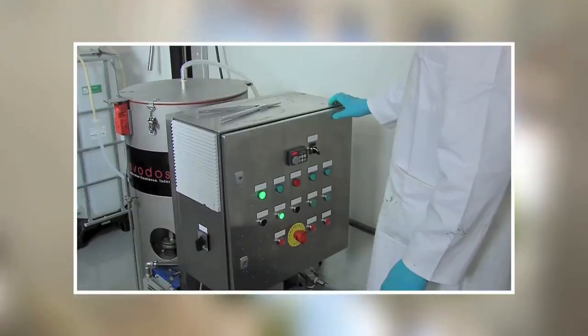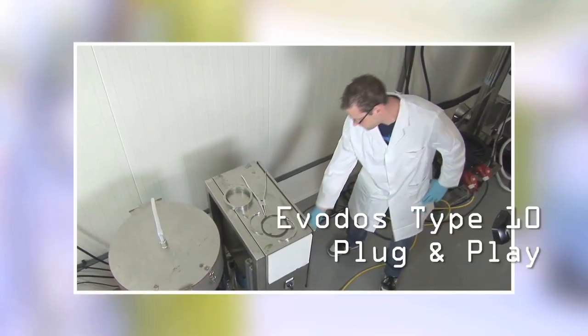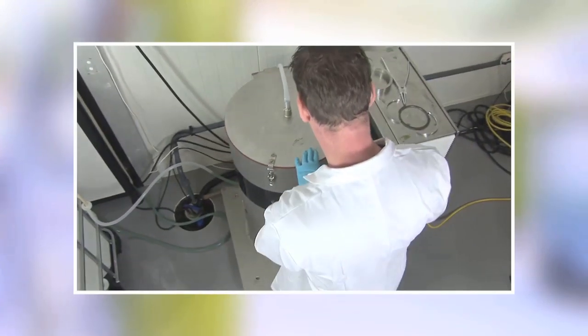The Type 10 is easy to operate. The machine is plug and play. You only level it horizontally, put in the power plug and there you go.